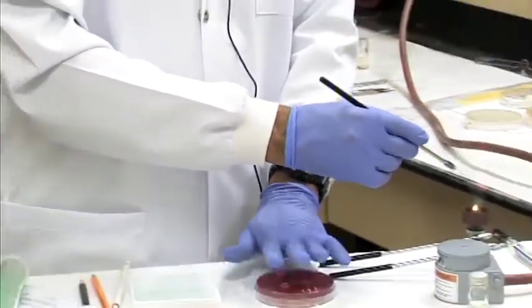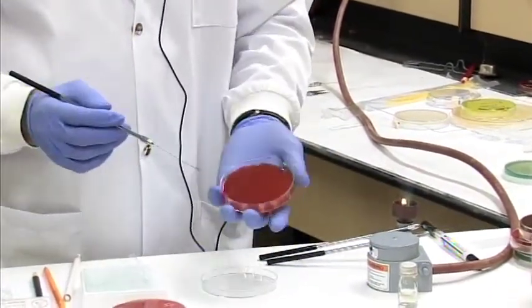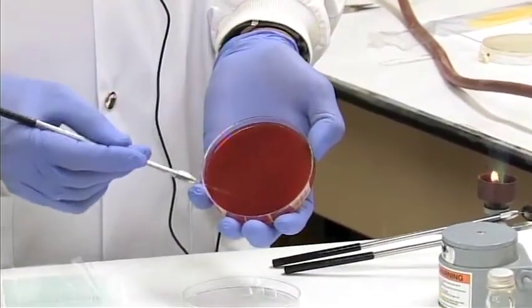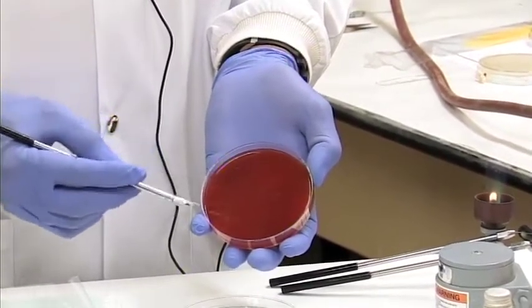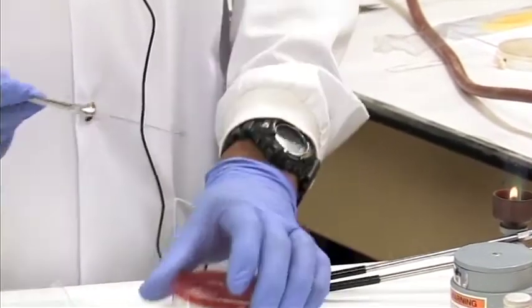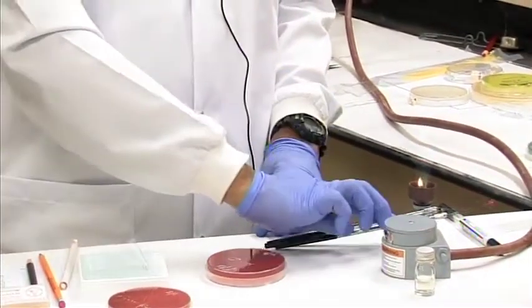Keep the plate covered while flaming and cooling, so as to avoid any contamination. I'm going to go now to the third quadrant, pull out again from the previous streak, and I can turn my loop over and do the fourth quadrant like this. All right.